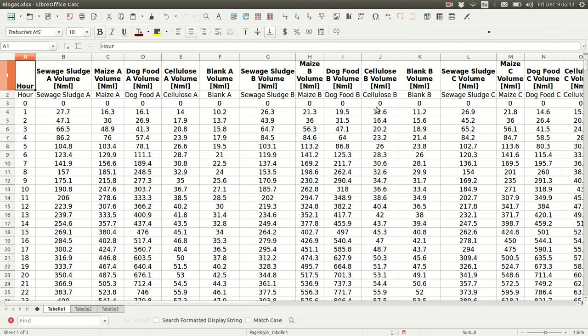This is a demo of AMPTS-2 biogas data processing in order to calculate BMP using OBA, the online biogas app. Many thanks to Conrad Cook for sharing these data.